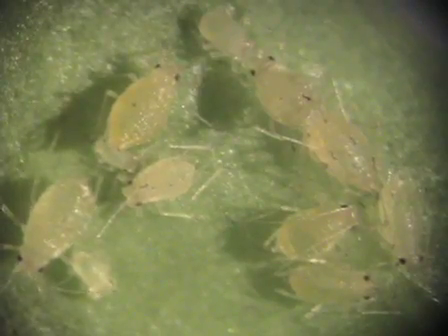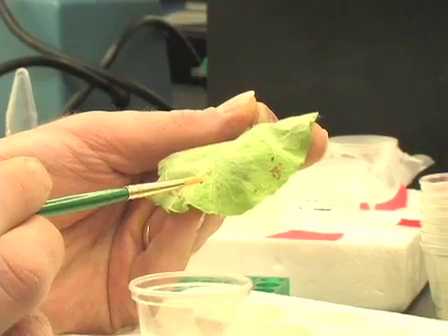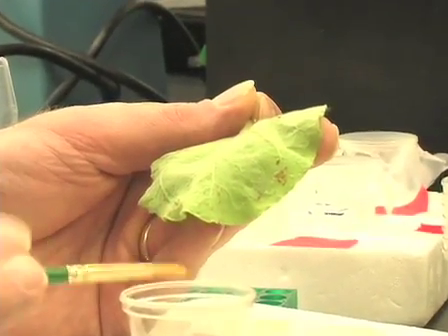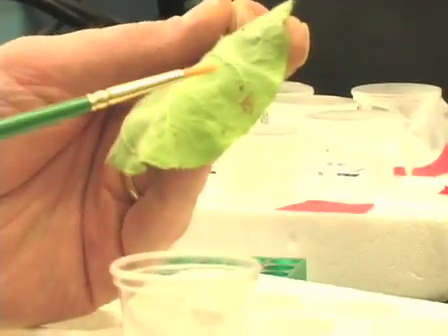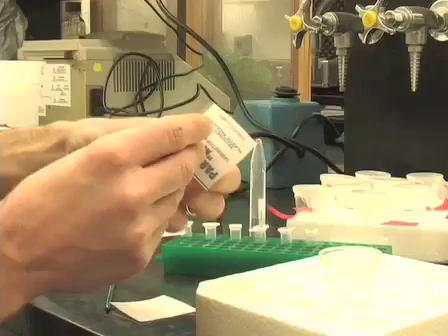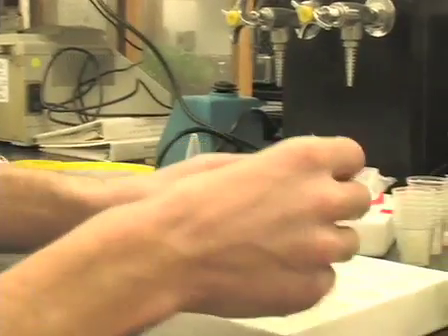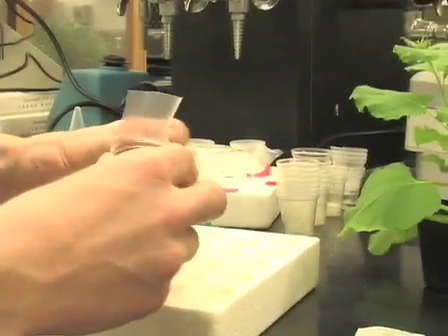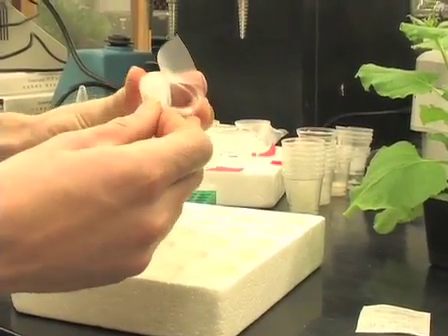When selecting aphids, it's important to choose insects of the same general size and color. Darker aphids such as this one may be older and not appropriate for this experiment. Then I'll stretch the first layer of parafilm over the top of the cup to contain the aphids.